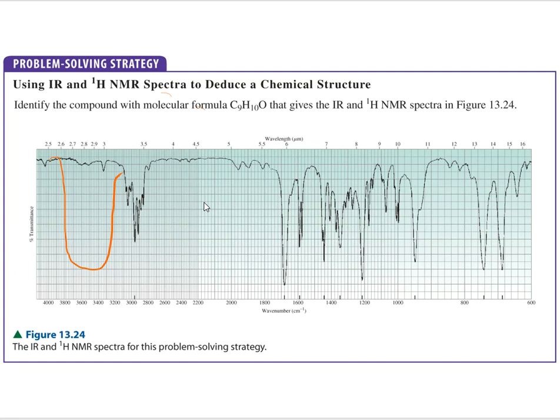So I know that I can throw out the alcohol group. And then our other choice was carboxylic acids, C double bond OOH. Well, this is not a carboxylic acid, because I know if it was, it would have this little jaggy little thing down there at the bottom, and we don't even have the big dip. So that would completely eliminate those options from the table.